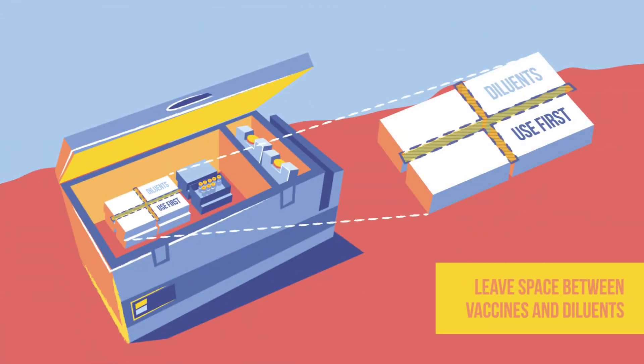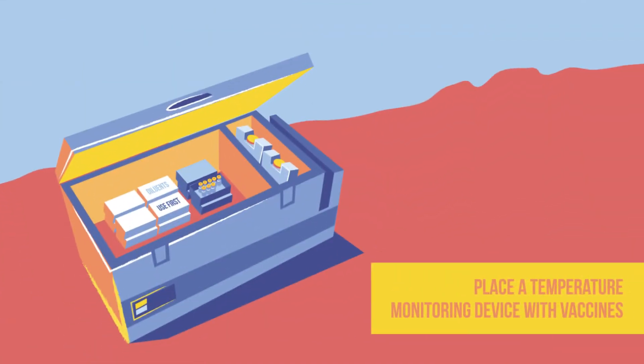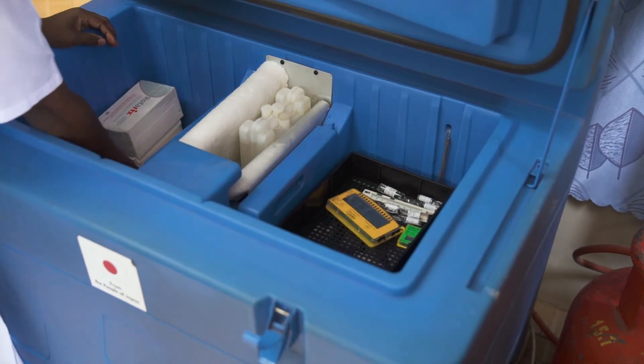Notice the space between the vaccines and diluants — this lets air circulate between them and keep them cool. There is also a 30-day refrigerator logger placed with the vaccines. Your facility may use a freeze indicator and thermometer instead.